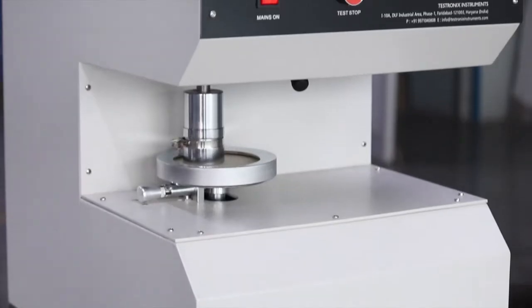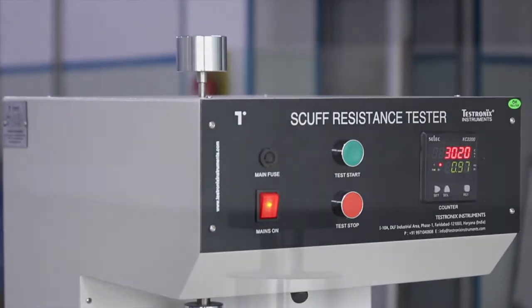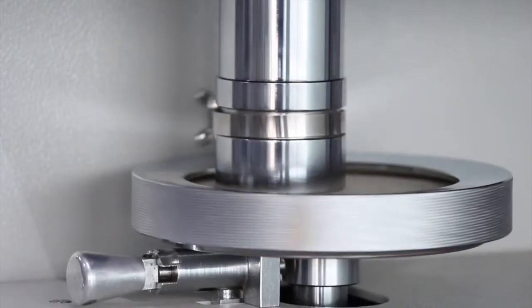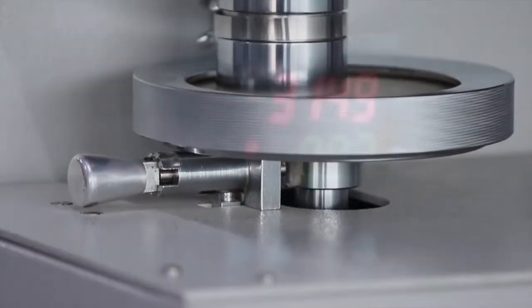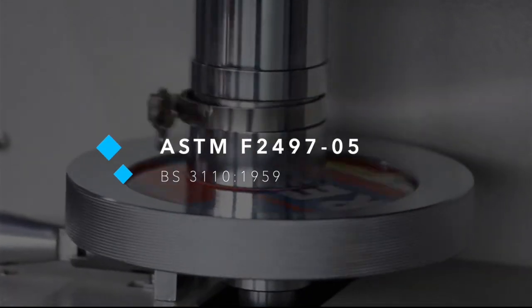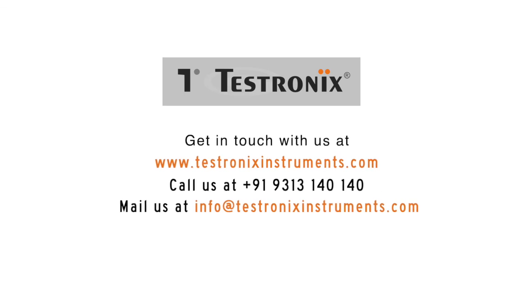During rubbing, the instrument offers precise results under uniform load and rubbing clamp movement with the help of controlled RPM of upper rotating discs. The TX SRT 100 complies with industry standards ASTM F2497-05 and BS 3110-1959.